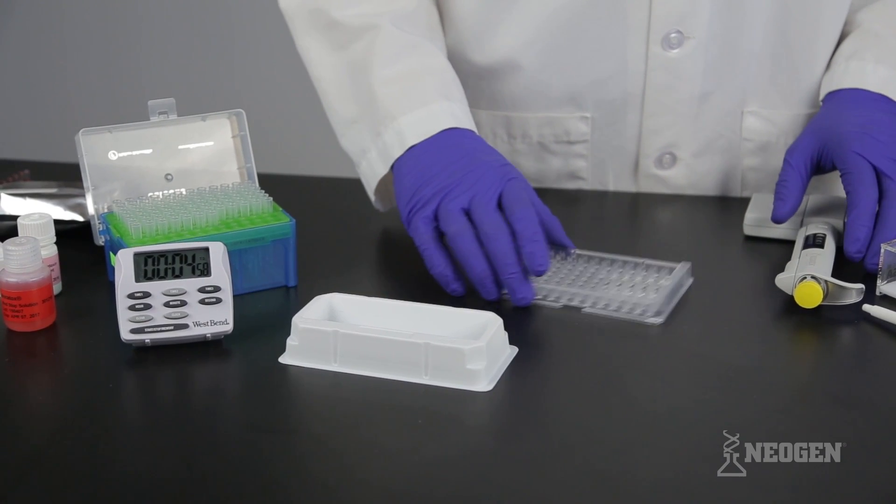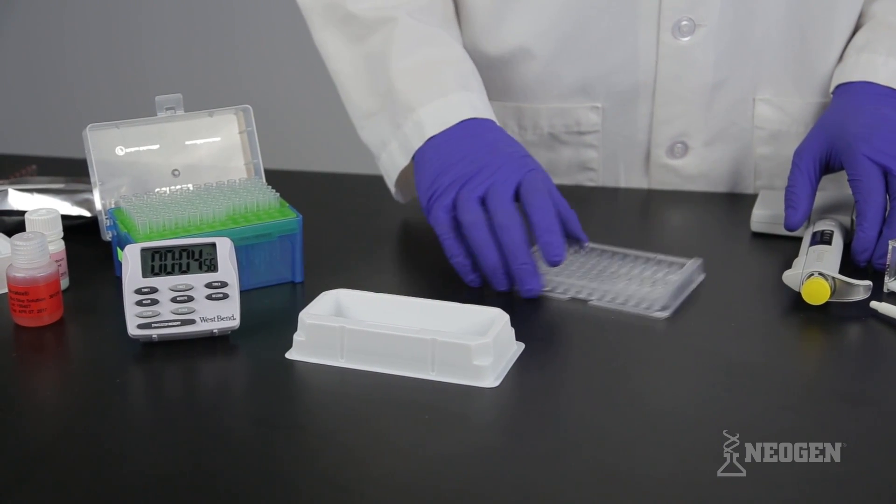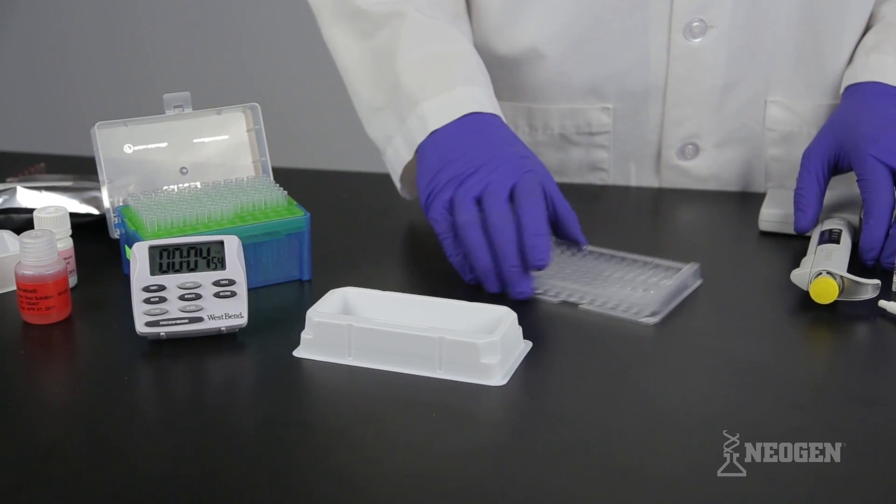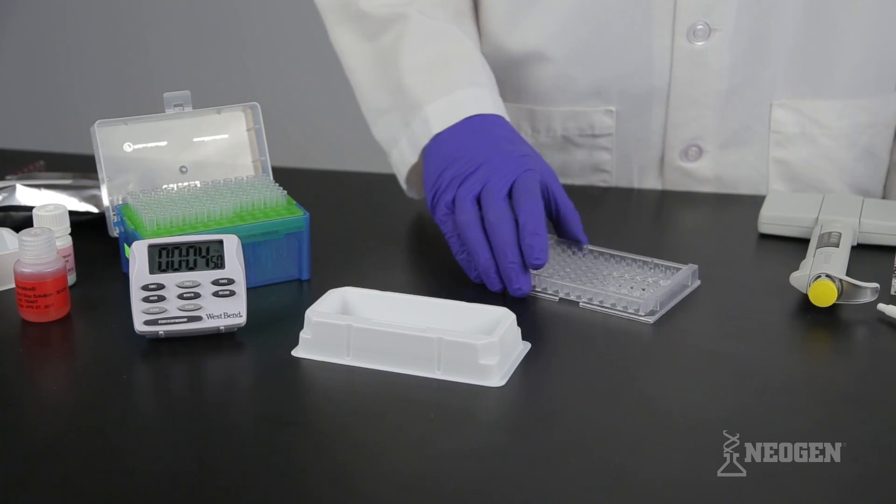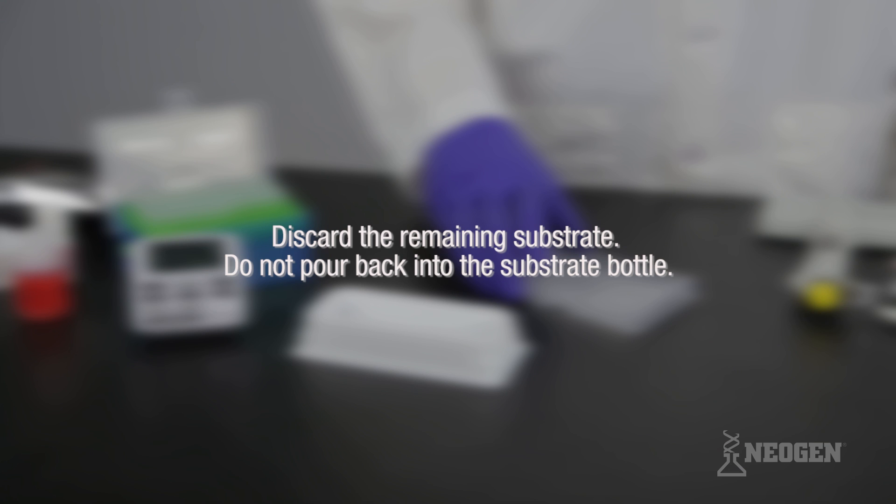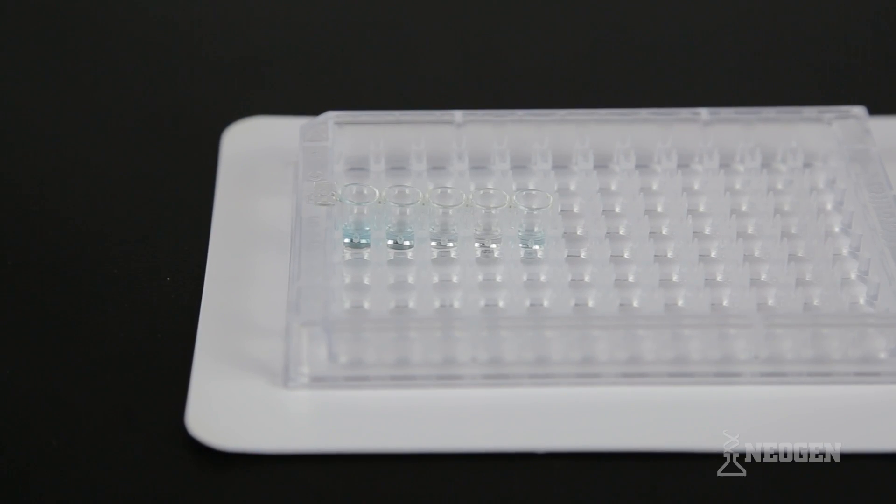During the first 30 seconds of room temperature incubation, mix the wells by sliding the microwell holder back and forth on a flat surface without splashing reagents from the wells. Discard the remaining substrate. Do not pour back into the substrate bottle. The liquid in the wells should change from clear to shades of blue.